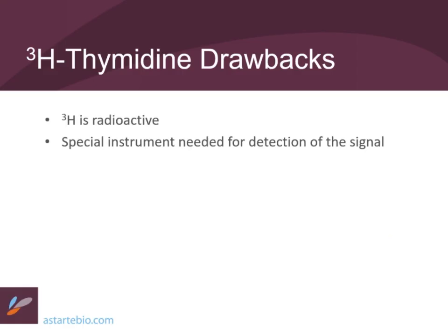The problem with this particular method is that tritium is radioactive, and there's been a lot of movement away from radioactive methods and finding other means of readout. And you need an instrument for detection of that signal. Having a devoted instrument just for that may not be desirable.